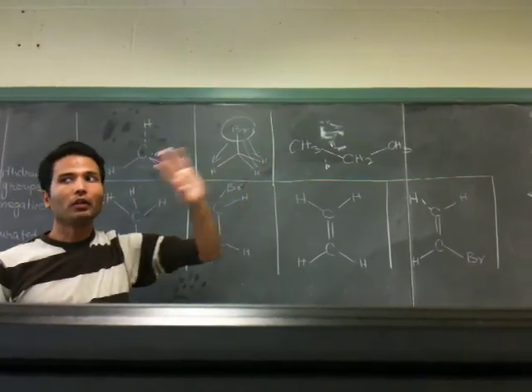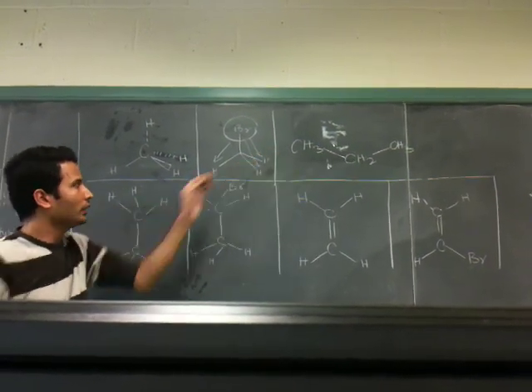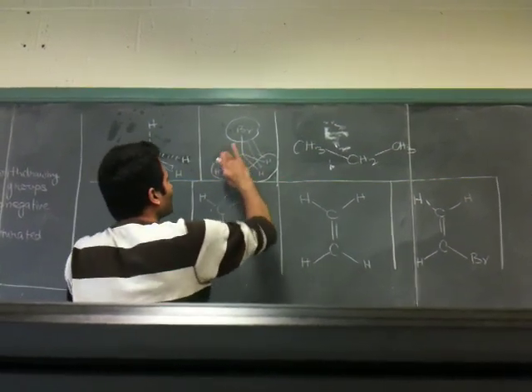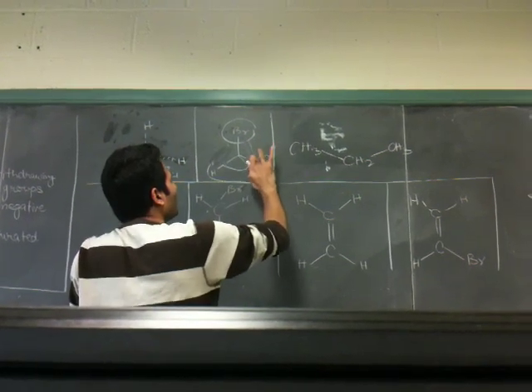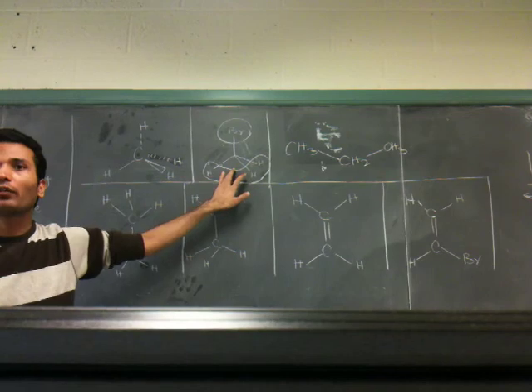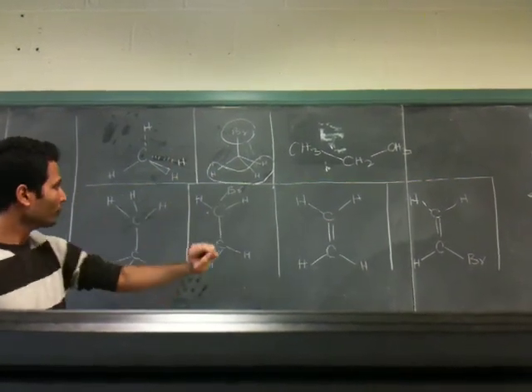I will come to that peak position and everything, but you can see these three are making one set. I will remove this arrow to reduce a little bit of clutter here. So these three make one set of protons. Okay? So you will see one peak.